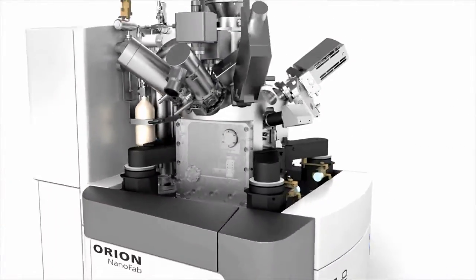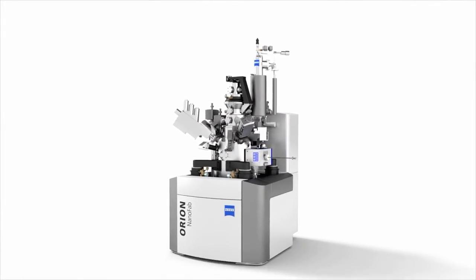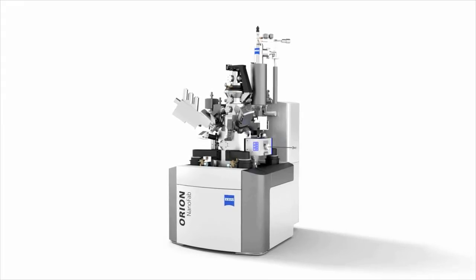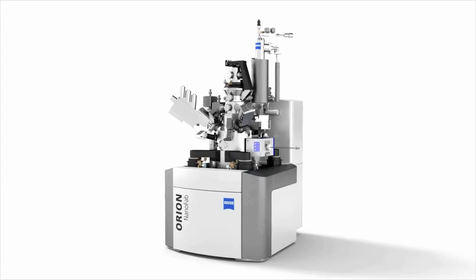Take advantage of the high resolution performance of your Orion NanoFab. With imaging resolution of 0.5 nanometers, Orion NanoFab generates high resolution images of your sample in the same instrument that you used for fabrication.